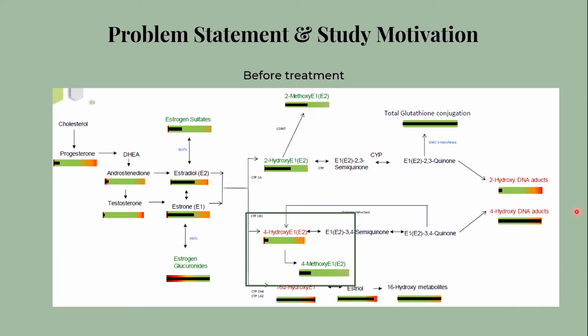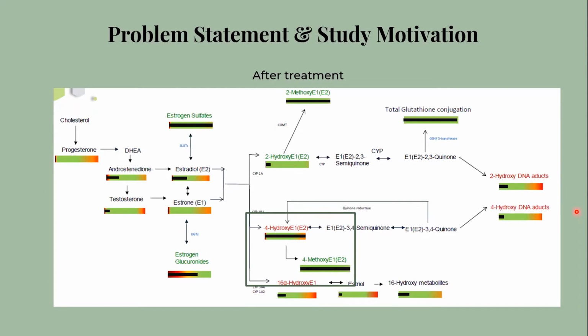After they have been treated with a cofactor cocktail that promotes the detoxification of catechol estrogens and the quinones, these profiles change, showing better methylation and less adduct formation.